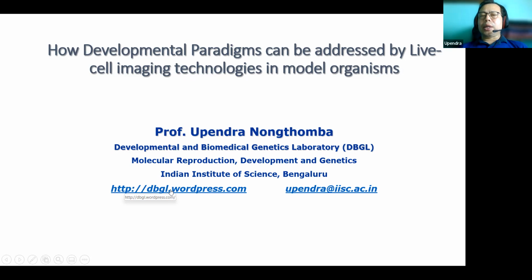Thanks to Partha, I think we were one of the first to use a model organism to look at the whole organism using light sheet microscopy. We are also using cryo-EM and things like that to look at how exactly things work at the molecular level.